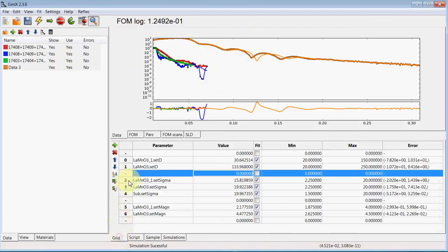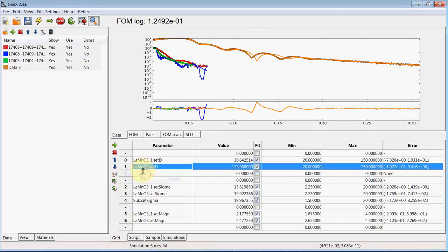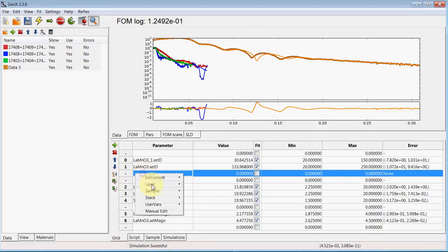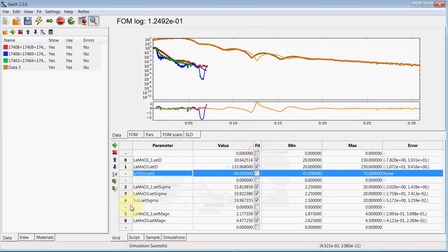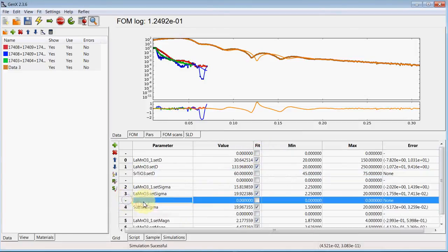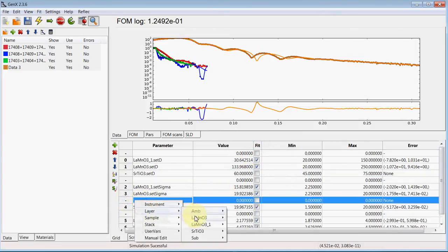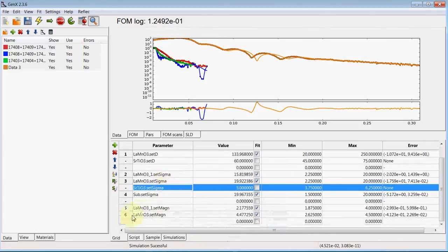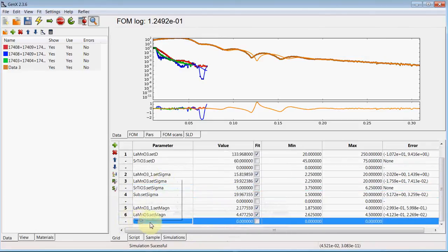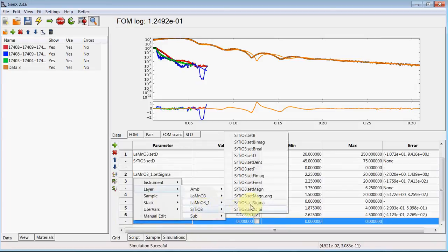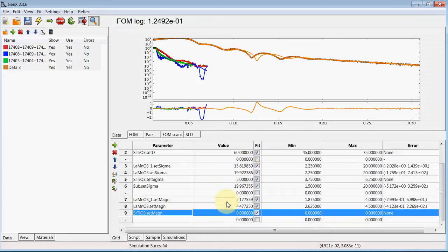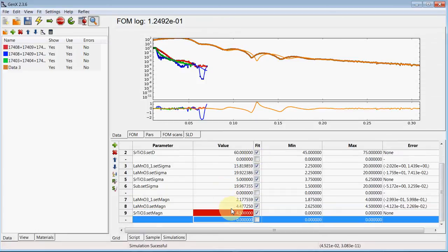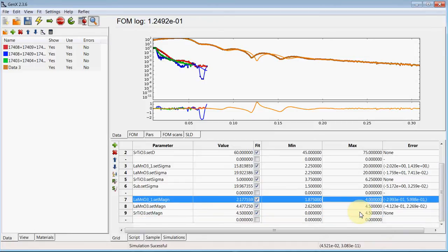We add the new layer parameters to our grid, select them for fitting, and define parameter ranges for this again.